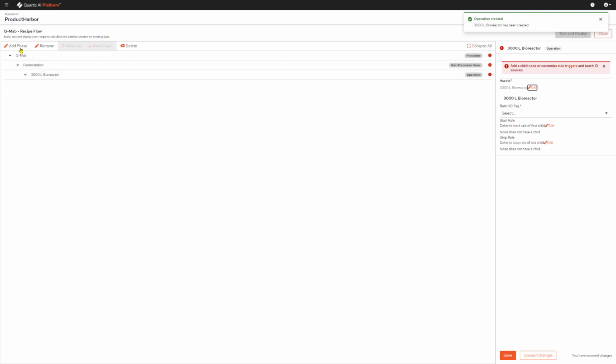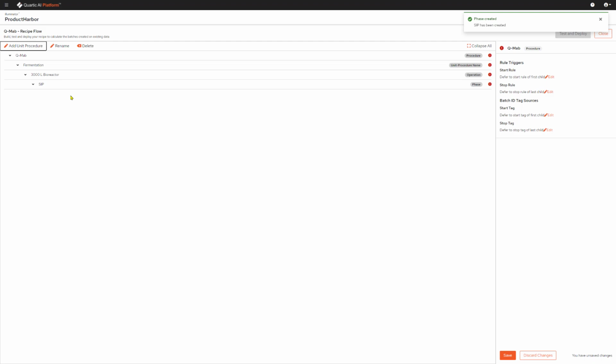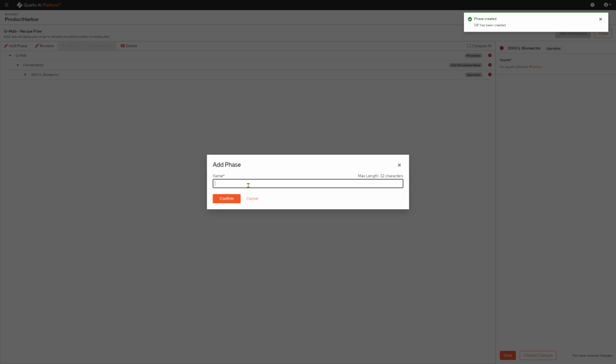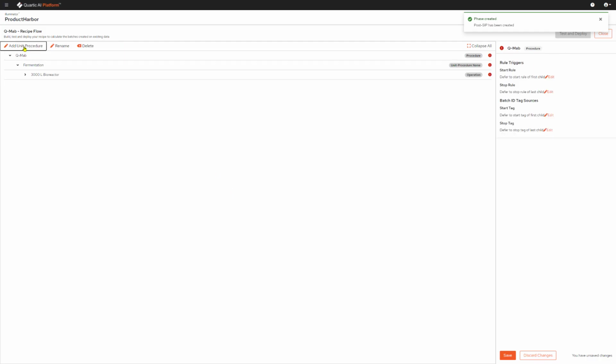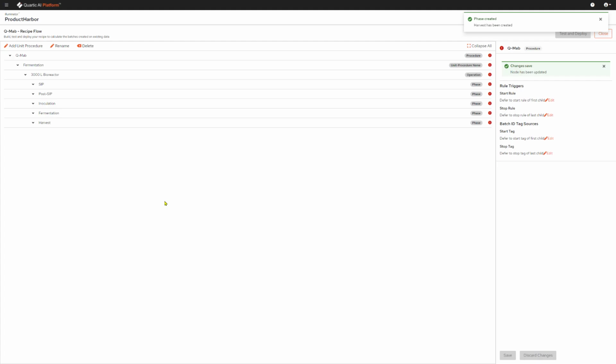Now I'll come in and add in those phases. So again, the first phase I had was a SIP phase. Then I want to add my post SIP. All right, so now I've added in those phases.